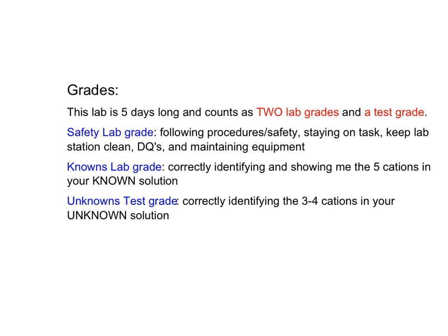We'll give you a little bit more of your unknown solution, and you're going to need to run through your tests again. See which something you did in your testing was not definitive, or you guessed wrong. You are free to make another guess immediately. We tend to advise against that, but it's kind of your choice. Every time you guess, you will lose another 10 points. So if you get it right the first time, it's 100. If you get it right the second time, it's a 90. Third time, it's an 80, so on, and so forth.